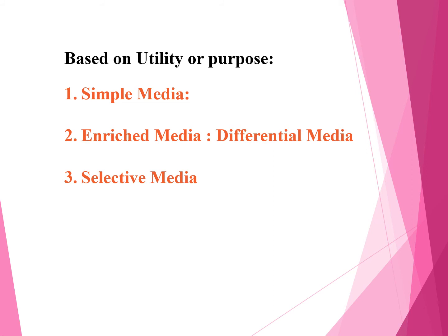This media provides nutrients that enhance the growth and predominance of a particular type of bacterium and do not promote other types of organisms that may be present in the sample. It is known as selective media, like selective media for Trichoderma.